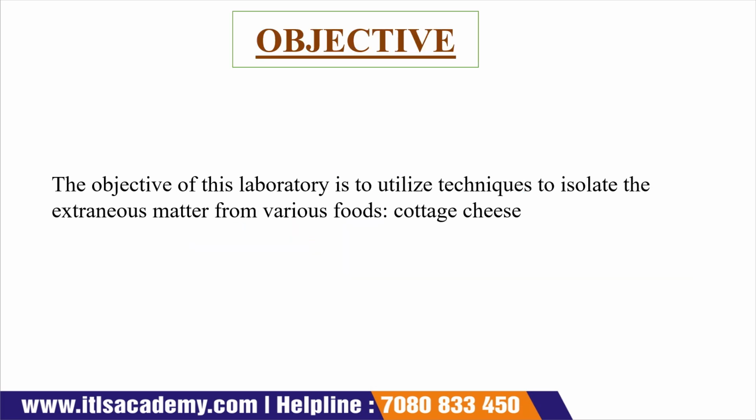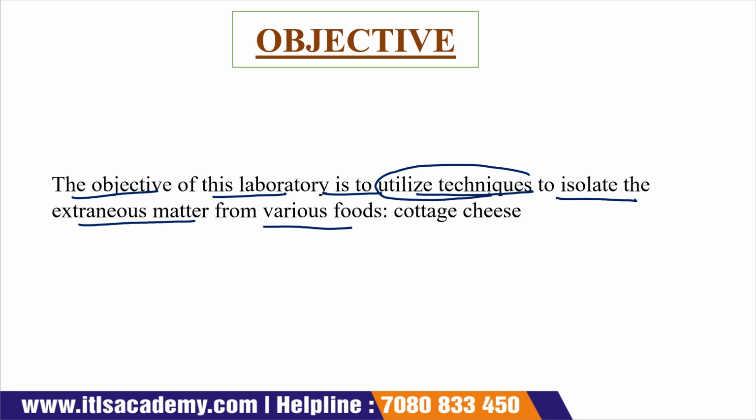The objective of today's experiment is to determine the extraneous matter present in cottage cheese by using a technique so that we can isolate it. Now see what is written in the slide. The objective of this laboratory is to utilize techniques. What should we do? We utilize different techniques so that we can isolate the extraneous matter from various foods, that is, cottage cheese. This is the objective of today's experiment.